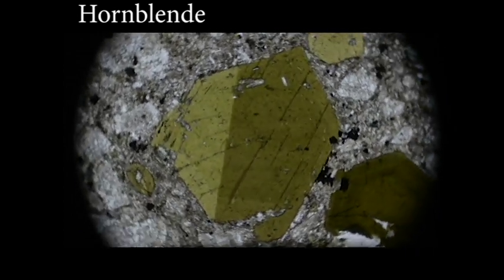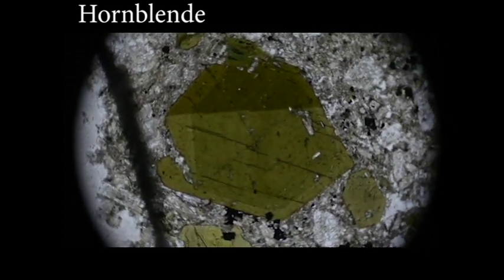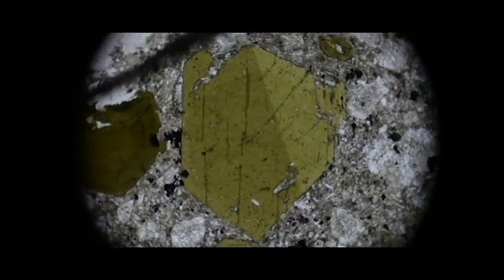Here we see another example. This is hornblende. It's green. It's twinned, but that's not important. But you notice that it changes from light green to dark green. So hornblende is light green to dark green pleochroic.